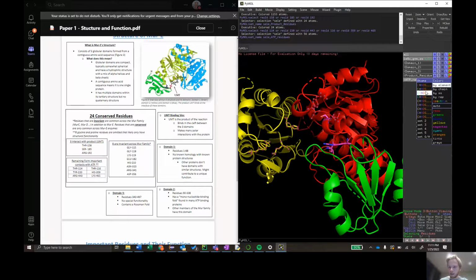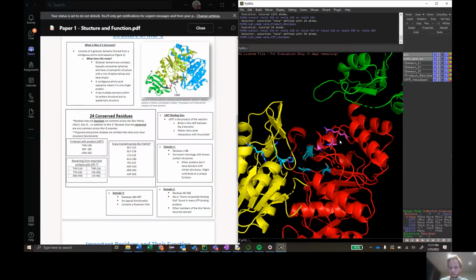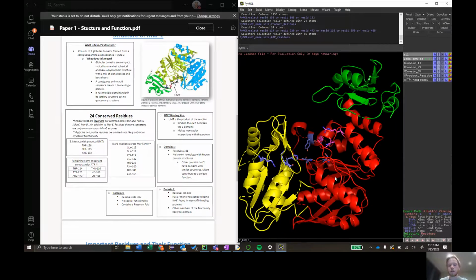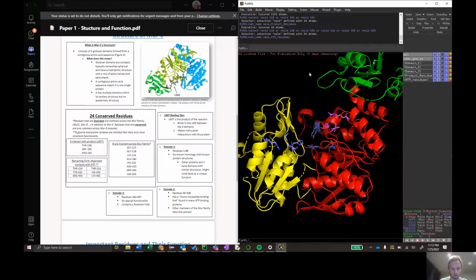I'm going to color these orange. Actually, that's an ugly color. Let's color them cyan. So these are the cyan residues. Actually, you know what? I'm just going to color them something blue. On second thought, it's a good idea to color your residues that are kind of background residues, just known structural features, a duller color, so that when you highlight the residues later, the specific ones that are interacting with the drug, you can make them a bit brighter and they'll pop more. So that's always good.